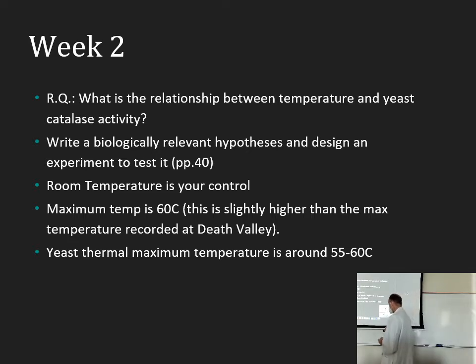The thermal maximum, and that's probably not even quite the right word, the lethal temperature for yeast is somewhere between 55 and 60 degrees. And it's not just because catalase may or may not denature. A lot of enzymes might have problems there. So pay attention to that target range.